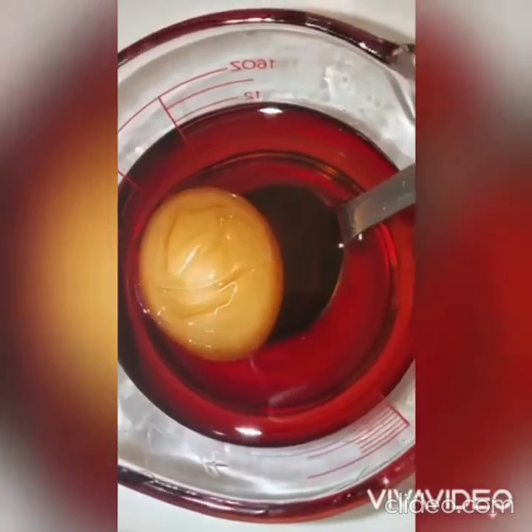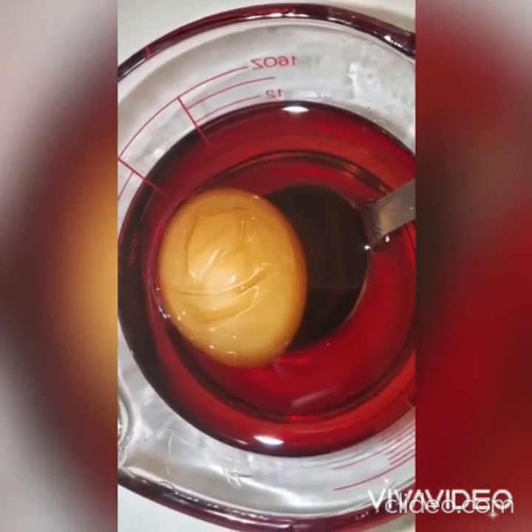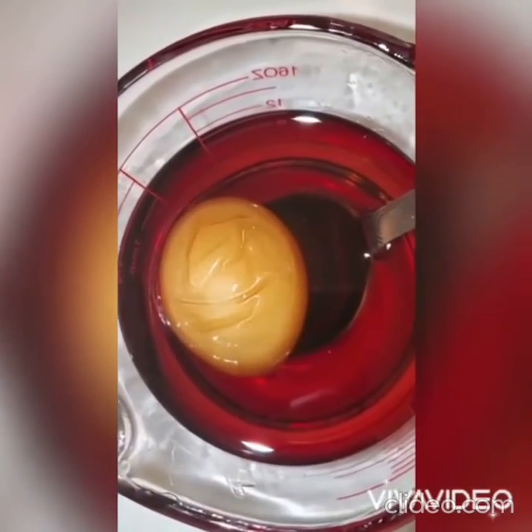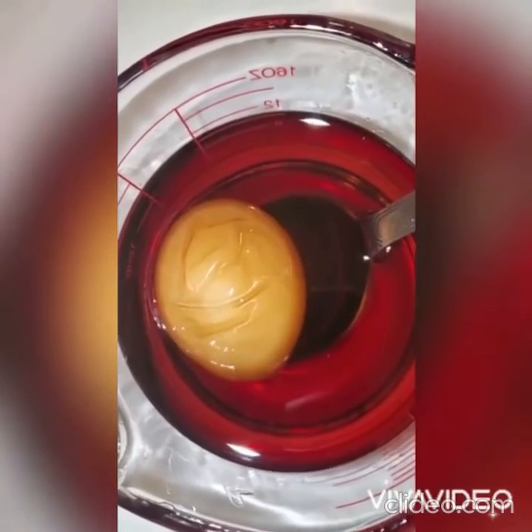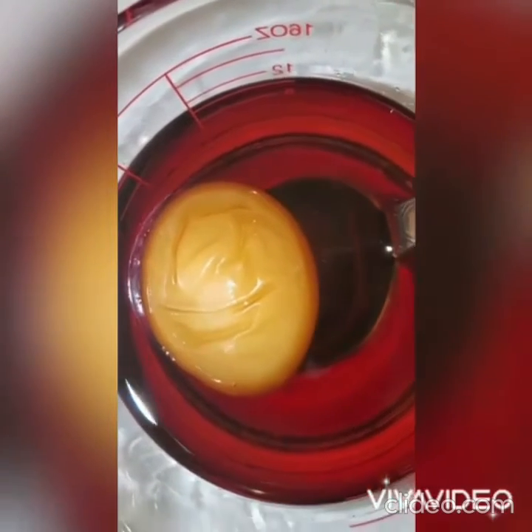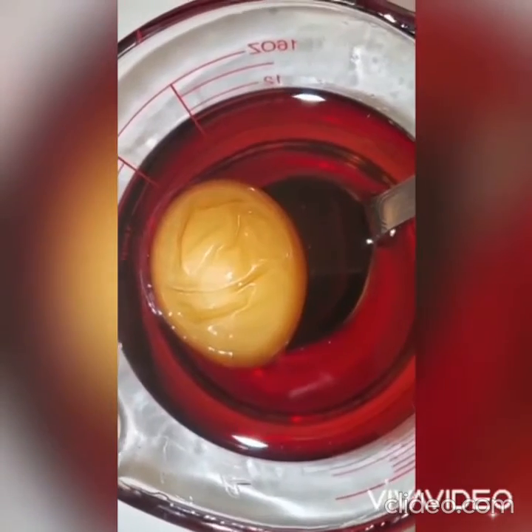Hi, so here is the egg after being in the maple syrup for 24 hours. Now I will be observing some physical changes that have taken place since yesterday. Yesterday we observed that the egg looked very turgid, whereas right now we can observe that the egg looks shriveled and flaccid and has lost its turgidity. We can observe the membrane is gathering together because it is not holding the same amount of water it was yesterday. The size and volume of the egg have also decreased.